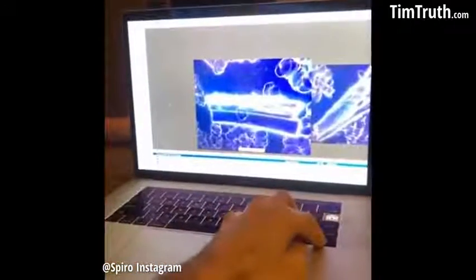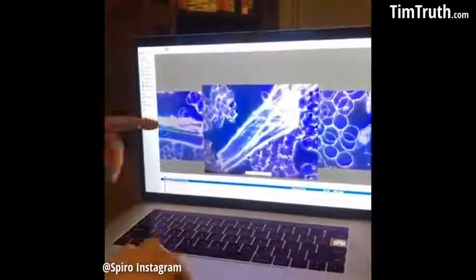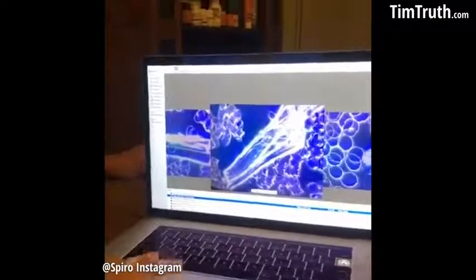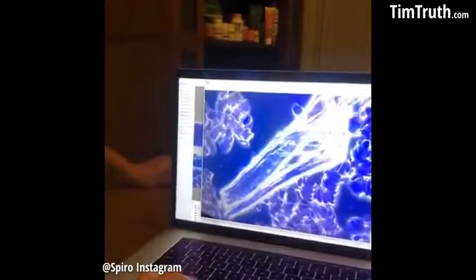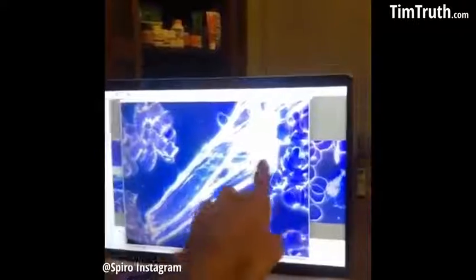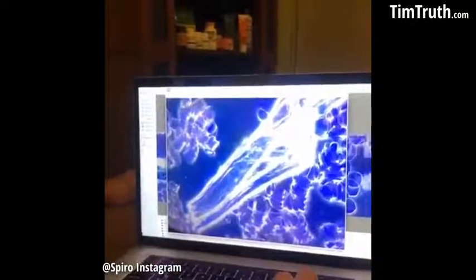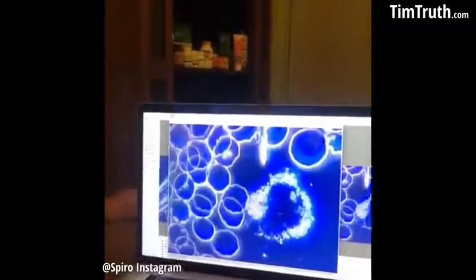Okay, so is that a new one? Did we take a look at that one? Yeah, this we haven't seen. Let's enlarge that. All right, so this is the same one or different? Again, that's unknown. We don't know what that is. Yes, definitely nothing organic.